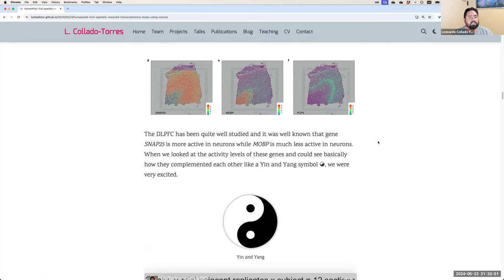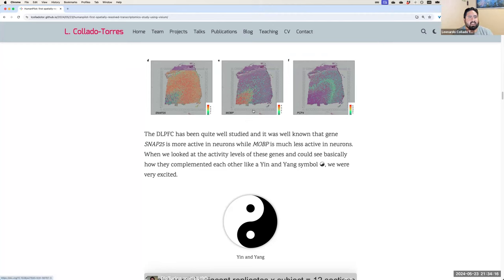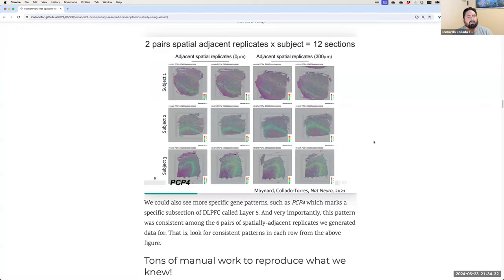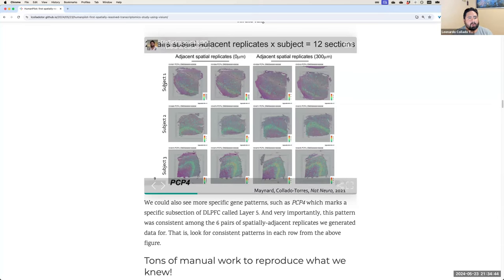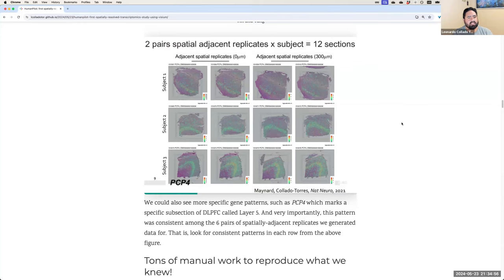We worked with data from a brain region called the DLPFC. Two known genes here are SNAP25, which is highly active in neurons, and MOBP, which is highly inactive — giving a yin-and-yang complementary pattern. We could also look at PCP4, a marker gene for layer 5, and across every pair of replicates the pattern was very similar, giving us confidence the technology was working.